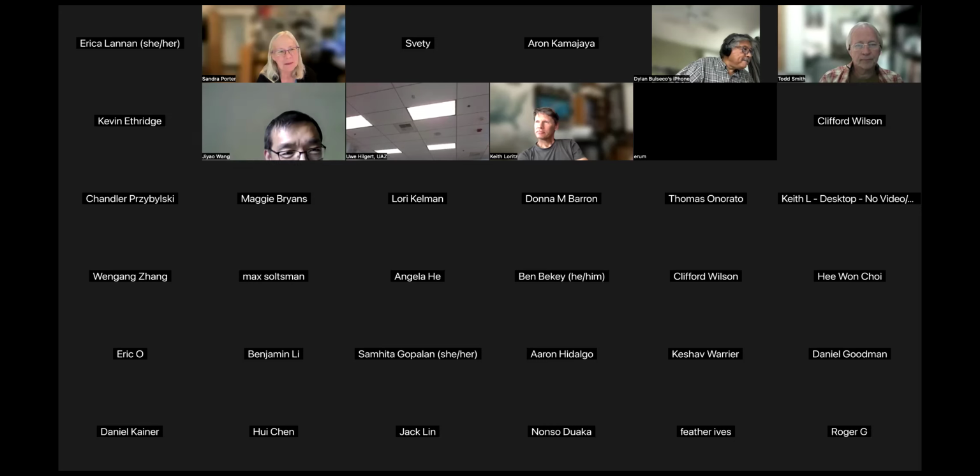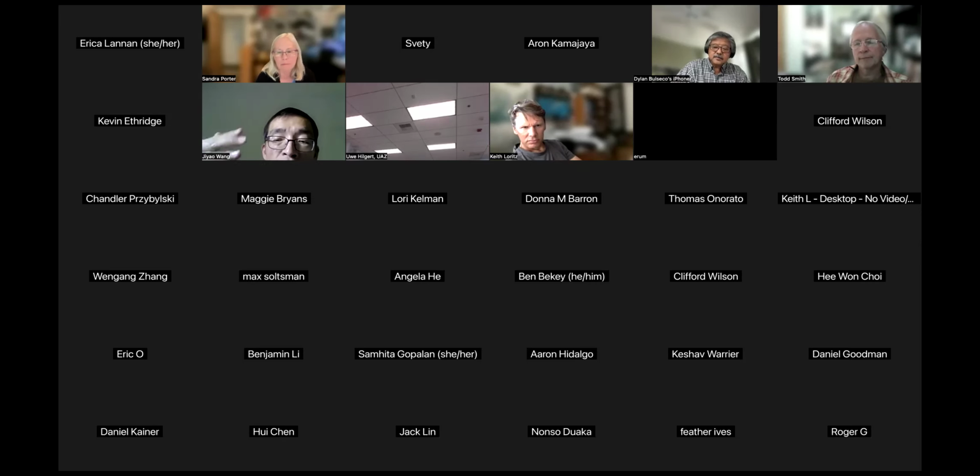Are people coming up with more questions? I was just going to ask, in that demo you did, how much of that is scriptable? I have multiple structures I want to step through and get the interactions out. Basically, if you can show everything in iCn3D, all the steps can be saved.